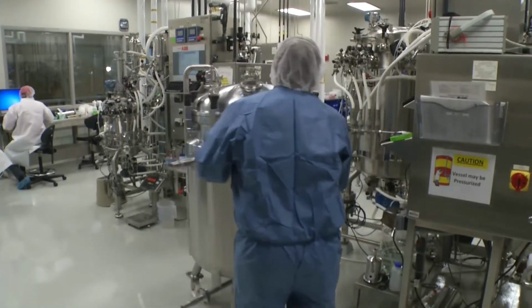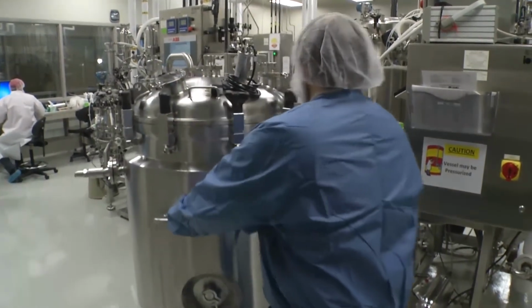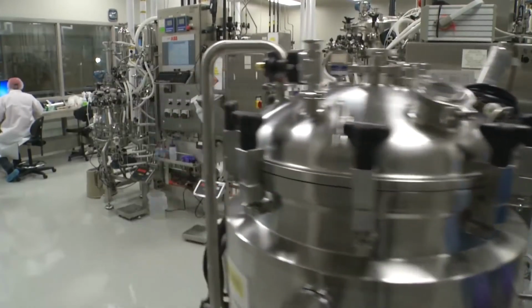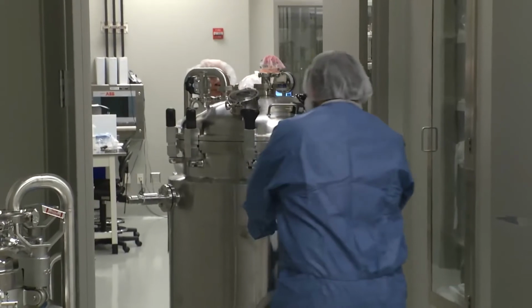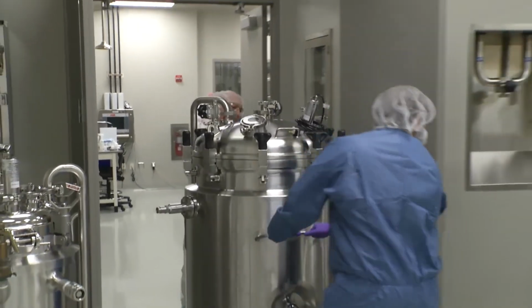The harvested broth will now move downstream to the recovery process, where the cells will be ruptured to free the green fluorescent protein, and the protein will be separated from the other broth components.